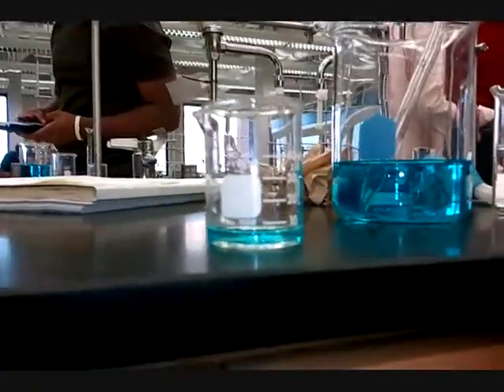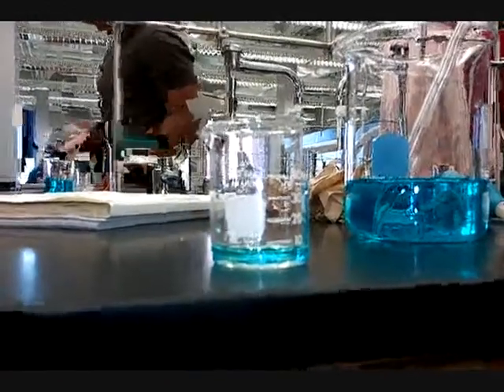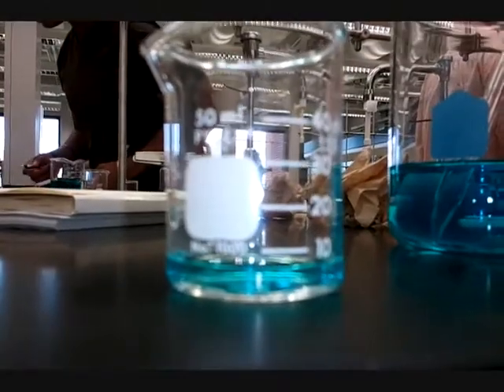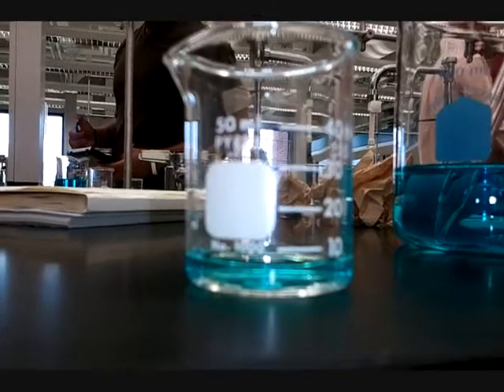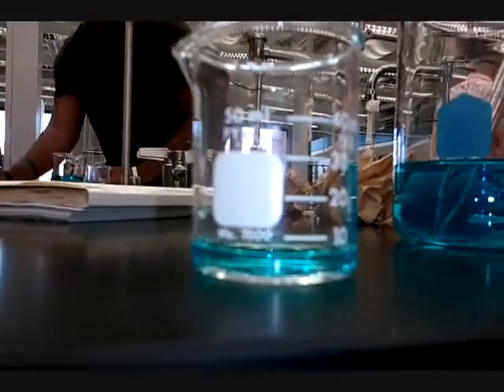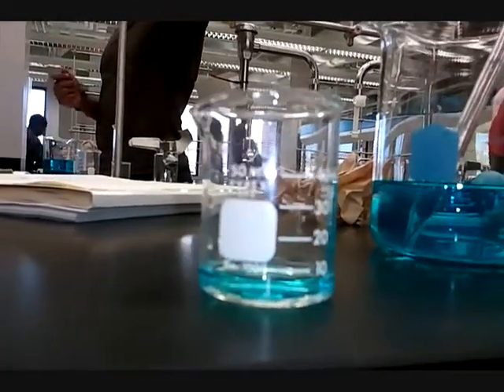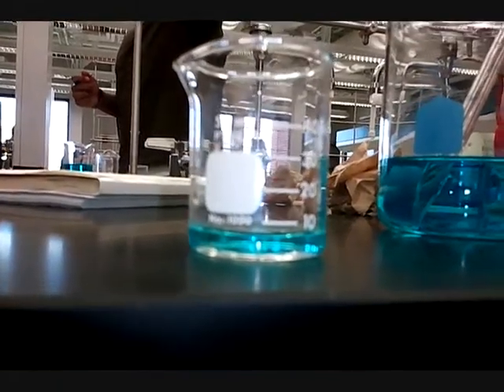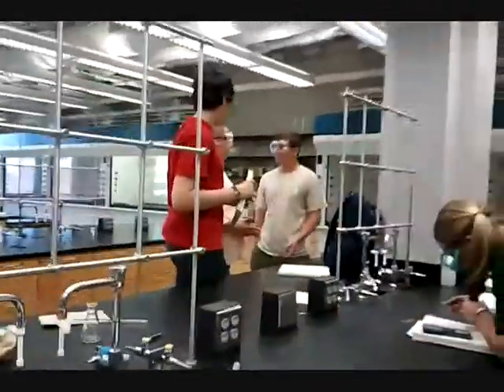And then at eye level, once again, measuring the meniscus. Measurement 1 minus the average, squared, plus measurement 2 minus the average, squared, and so on, and then over the number of measurements minus 1. So, yeah, 8.2 maybe? Yeah, that's about right. Alright, so we're going to say it's 8.2. So now I'm going to record our data.